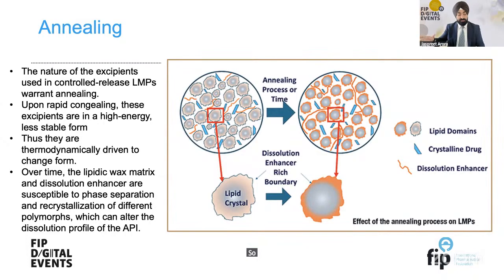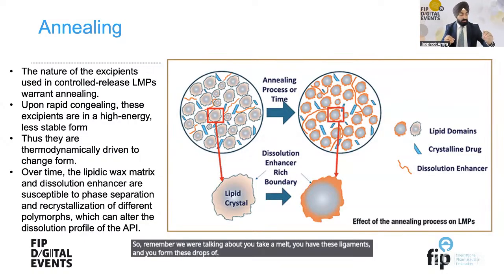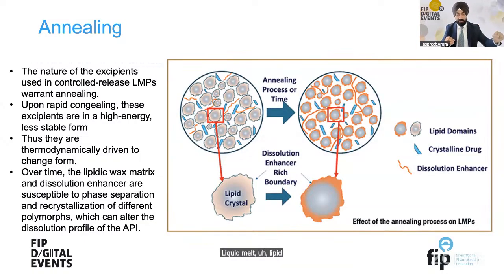So remember, we were talking about you take a melt, you have these ligaments, and you form these drops of liquid melt lipid, and then it quickly congeals.